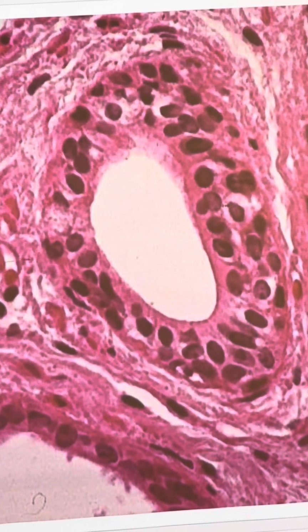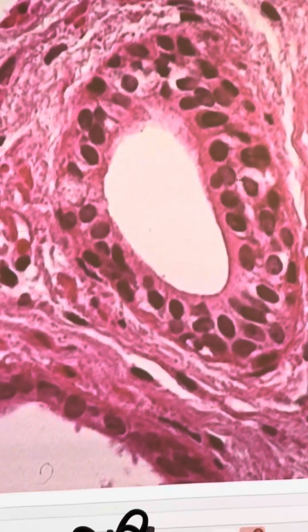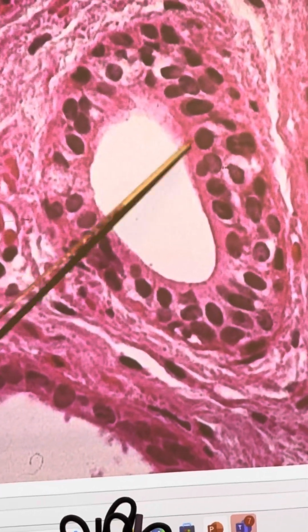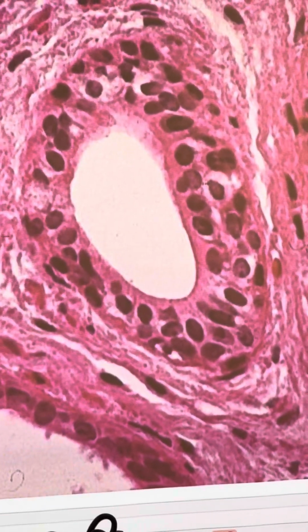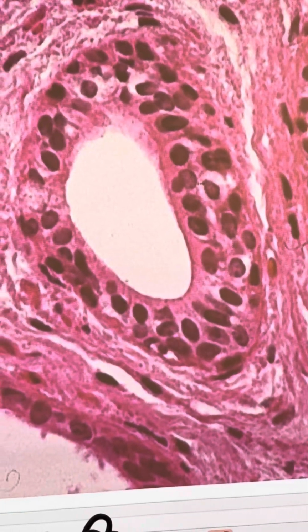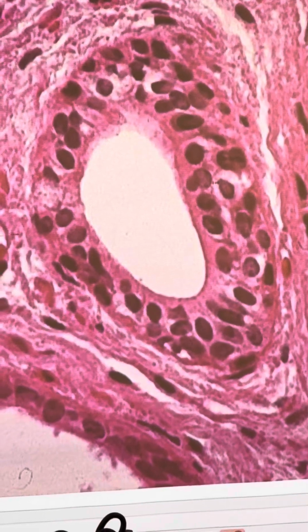Where could you find that? Usually in a bigger duct, like a sweat duct or a mammary gland. And if you look at the lab manual, it gives the duct a structure so it doesn't go flat. Did you guys do that one? Some people do that one, some people don't. Maybe it'll be extra credit, I don't know.